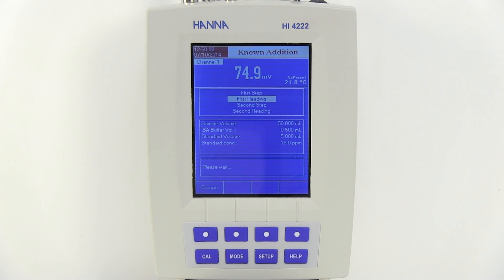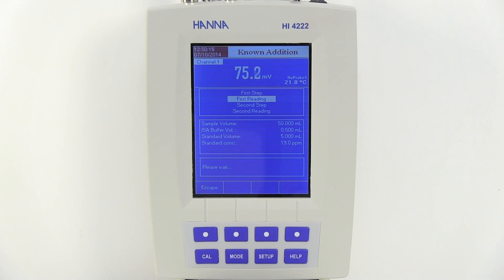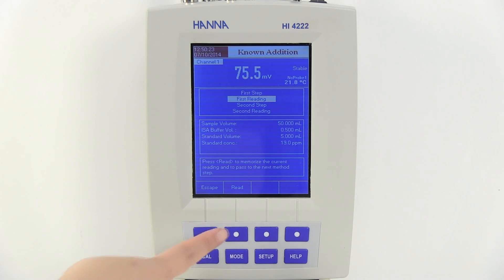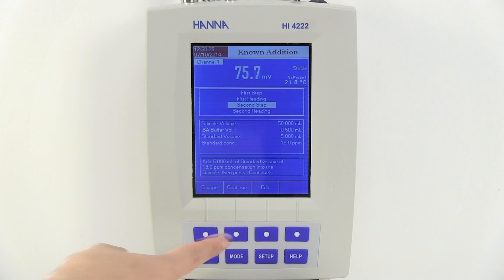We are now in the first reading stage. The meter will now wait for a stable reading indicated by the stability icon in the top right corner of the screen. When the reading has stabilized, the meter will prompt you to press Read.